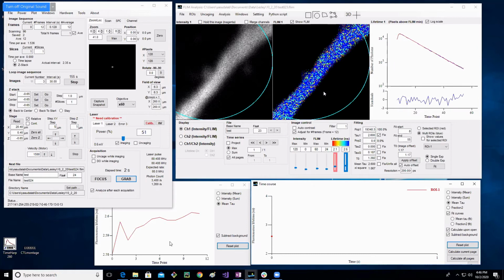This is a primary dendrite, so typically you're not imaging things that bright. The 10 to the 3rd range, I'd say, is pretty acceptable. Good. You can get an experiment with this low noise. If your peak is at like 10 to the 2nd, it's sort of borderline. Your data might be quite noisy, and you'll probably have to average a lot of experiments together. And anything really below 10 to the 2nd, I'd say is probably not worth doing.